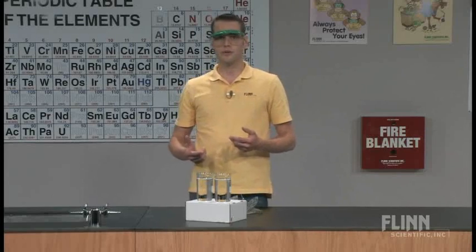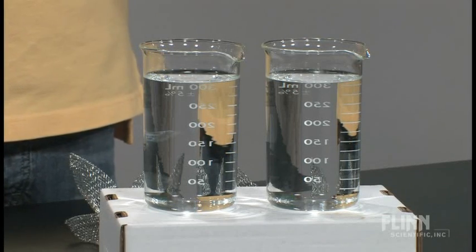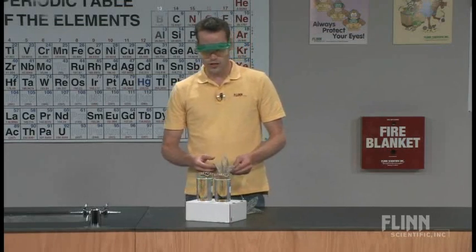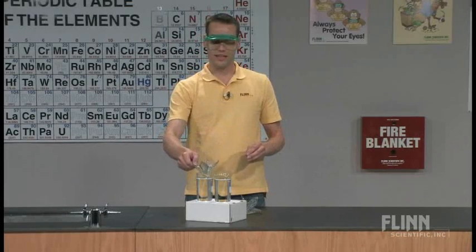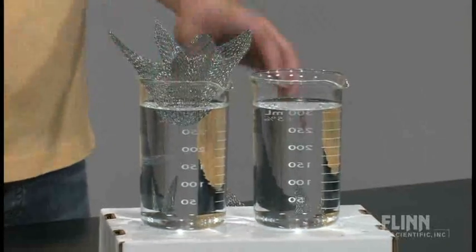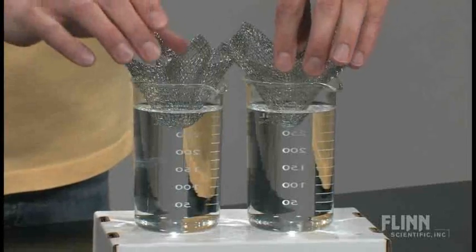Inside both of these beakers, I have a 0.25 molar concentration of sodium hydroxide. These solutions are measured out to be about the same volume. If you purchase the kit, you'll also get pieces of wire screening that you just need to fold into a basket shape so that it fits inside the beaker and these substances will be able to dip down into the solution. Both of these are just regular ordinary steel wire mesh screening.